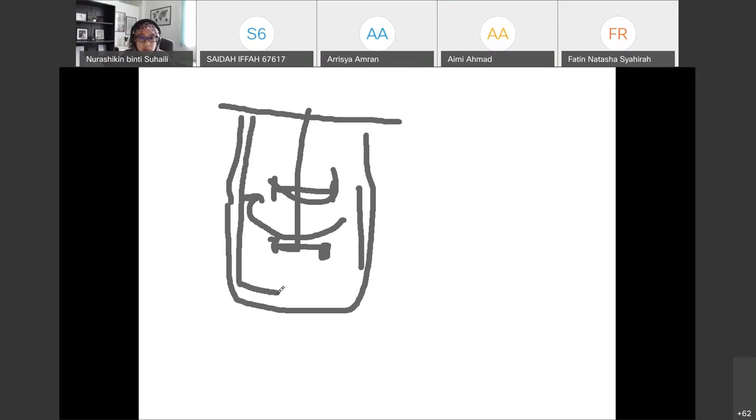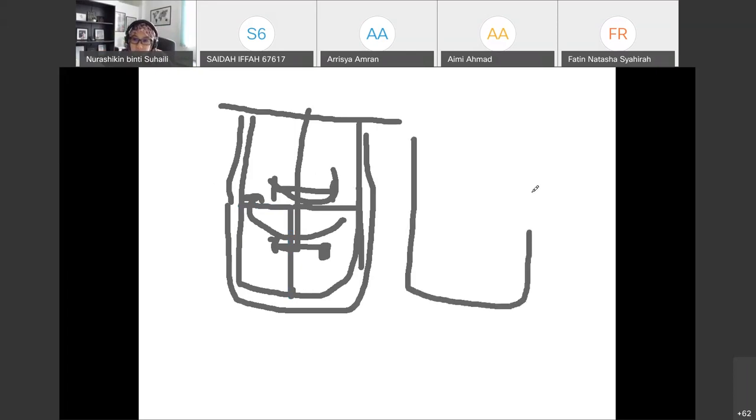It is something like a structure, like a piece of metal around the vessel. So when you take off the top plate, the lid of the reactor, the baffle is attached to that. The function of this baffle is, let's say without a baffle, this is the impeller, it will rotate here. But at a certain point, there is a dead zone.